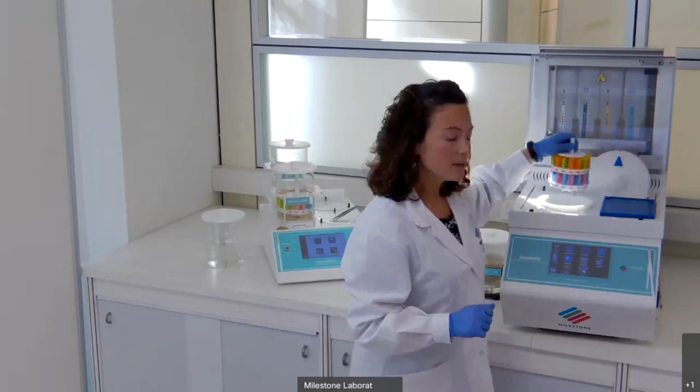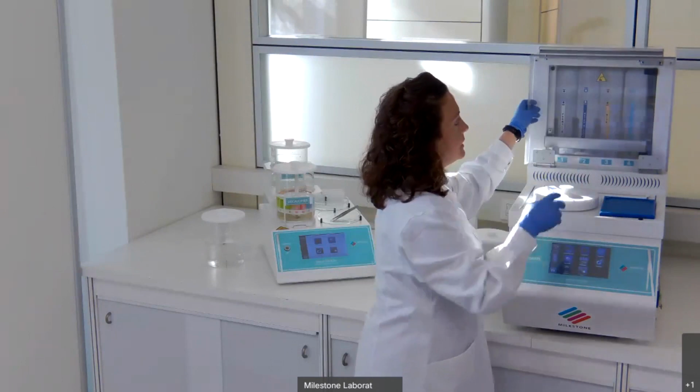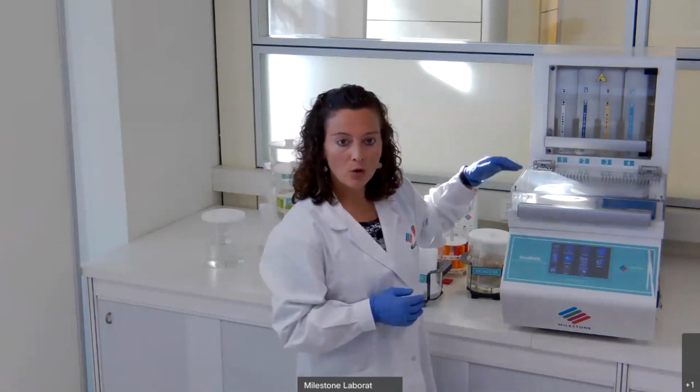If the decalcification is completed, the process can be completed. Otherwise, if the decalcification needs to be prolonged, we can go back to the decalcification up to 3 times. All this decalcification will be saved by the unit in the saved run. Decalmate uses the same rack that we saw for the bone station, and like the bone station, it can be used with any kind of decalcification reagents, such as chelating ones and very strong ones. Being an automatic unit, like the tissue processor you may be used to, it has a lot of safety sensors for the loading and unloading of the reagents, temperature sensors, and so on.